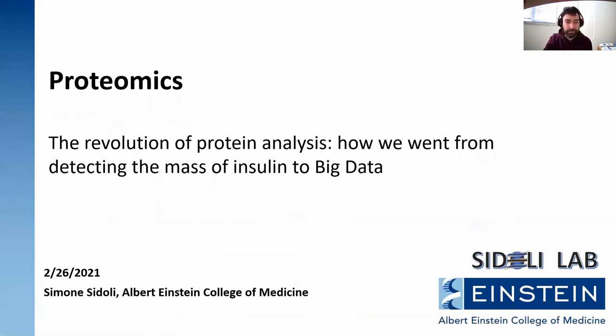So with this, I would like to stop here, because the next thing I want to tell you about is quantification. So now you know how a peptide or protein is being identified by a mass spectrometer. What we're going to discuss tomorrow is how we extract the abundance of this protein and how we use it to provide biological meaning. So yeah, Wagner, I think maybe I'll stop here.